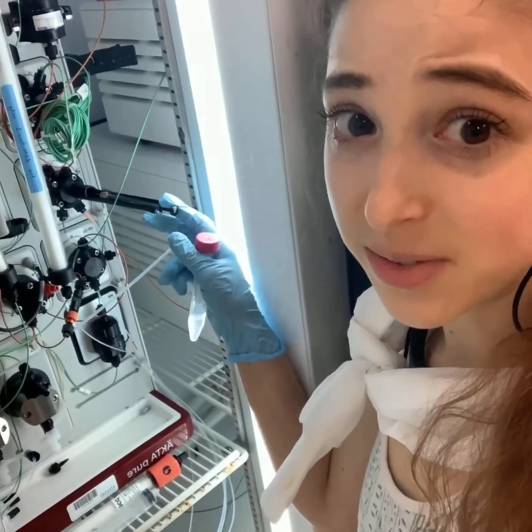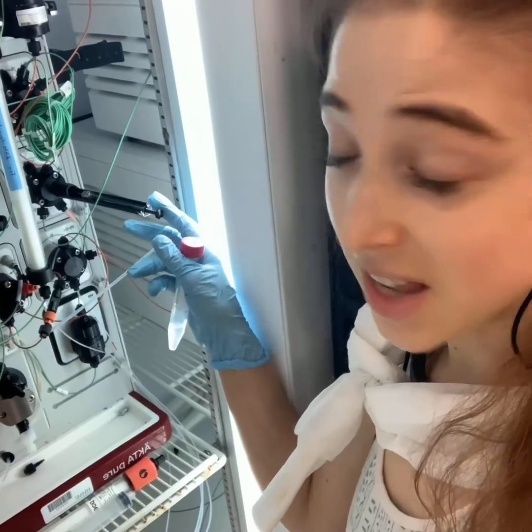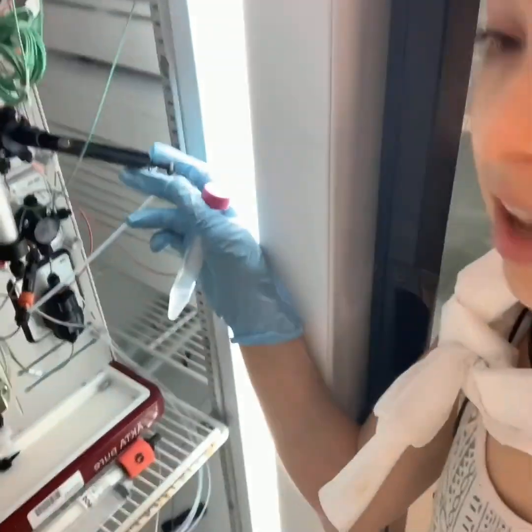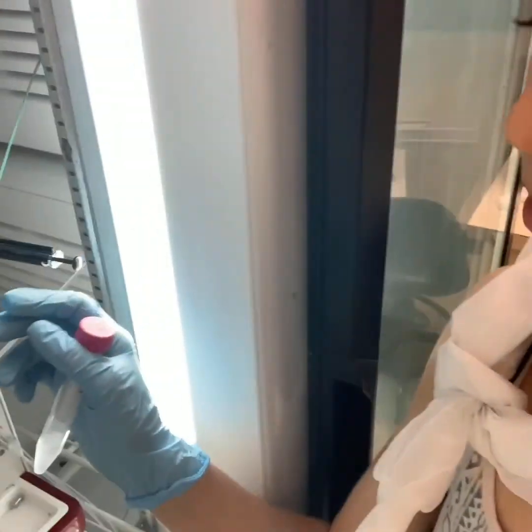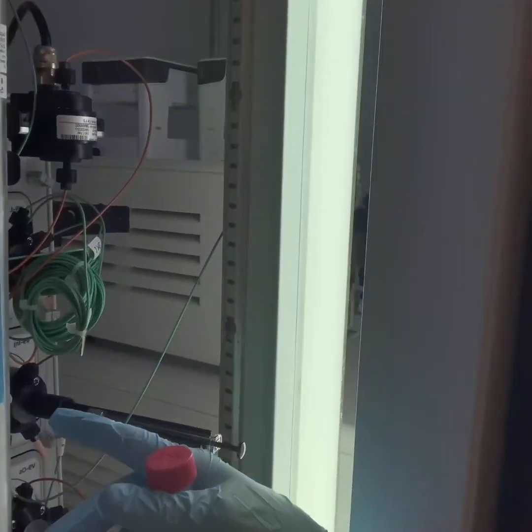Size exclusion chromatography, or gel filtration, is a way that we can separate proteins by size. I'm doing it this morning. I just injected my protein sample into this machine called an AKTA, and it's going to send it through this chromatography column.